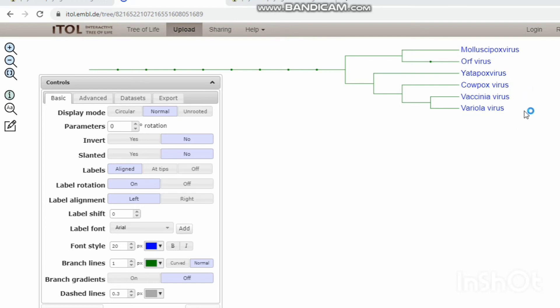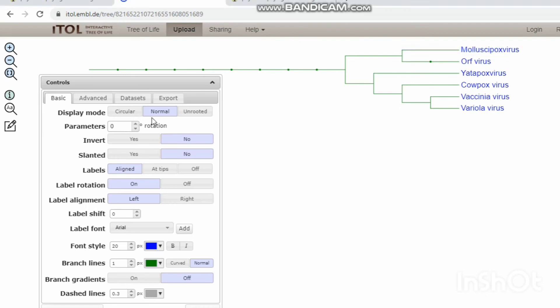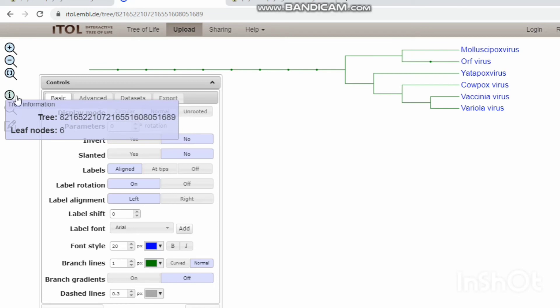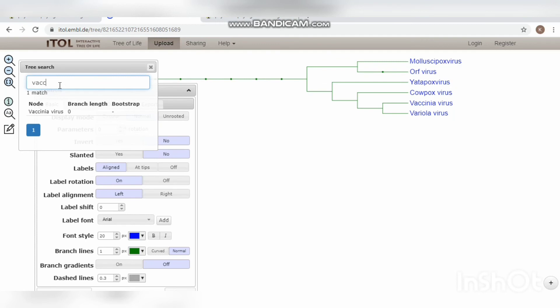The most closely related species are molluscum contagiosum virus and ORF virus. Molluscum contagiosum virus and variola virus are the most distantly related species. The tree information section shows the tree name and the nodes. The tree search option is used to search for a species within the tree — I give the vaccinia virus name in the search box and it is marked with a red line.